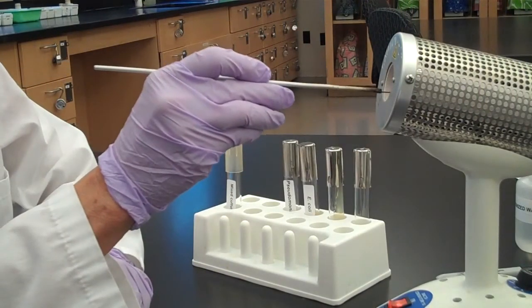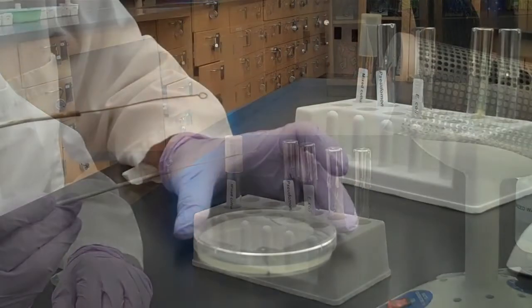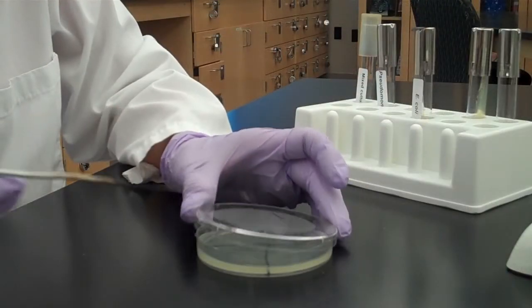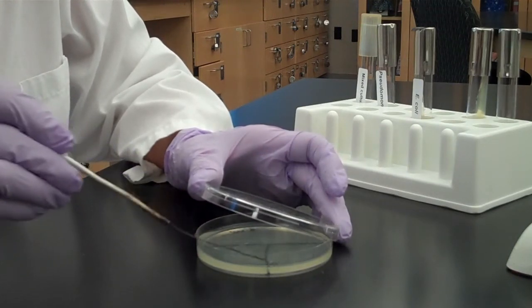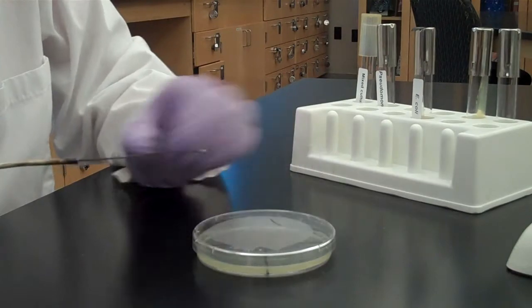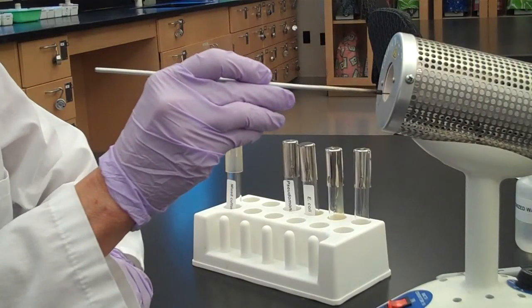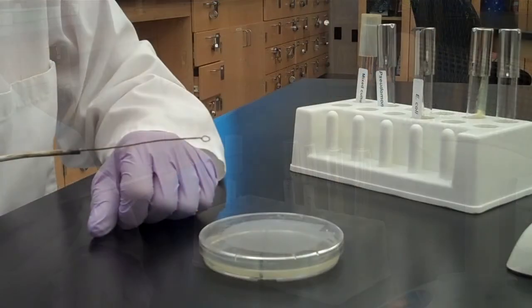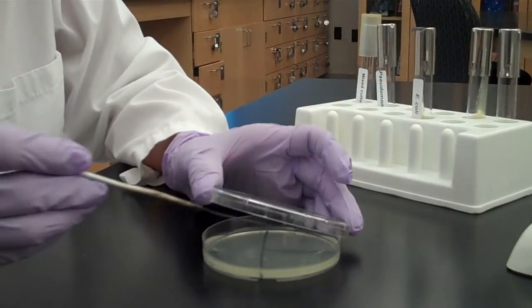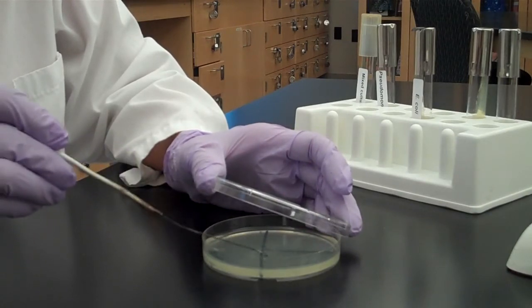Sterilize your loop and let it cool. Pull bacteria one time from the middle of section 1 into section 2 and spread it out to fill section 2. Sterilize your loop and let it cool. Pull bacteria one time from the middle of section 2 and spread it out to fill section 3.